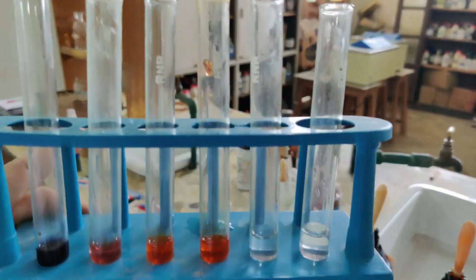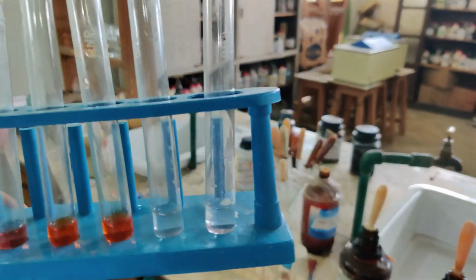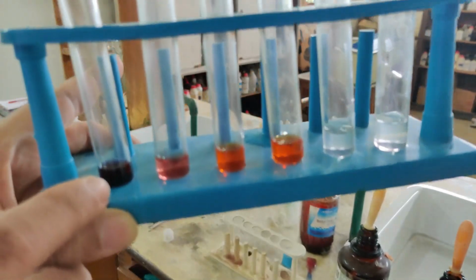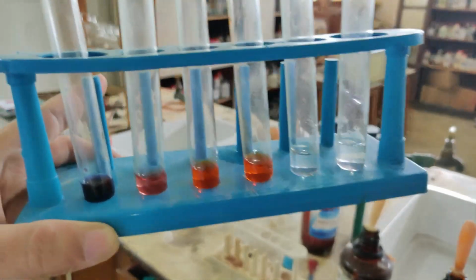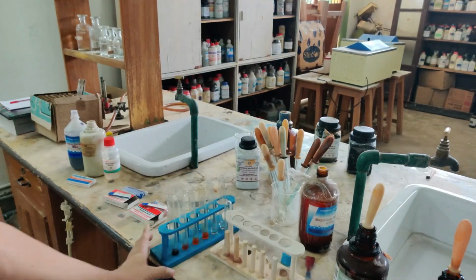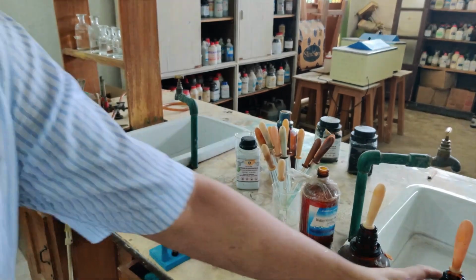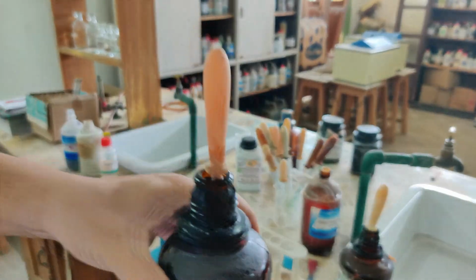Now we will see what changes will take place in the color when I add acid and base. Since this one is blue litmus, I am going to add acid to this. Blue litmus will turn to red if we add acid. So here it is. Let me take dilute hydrochloric acid in the dropper.